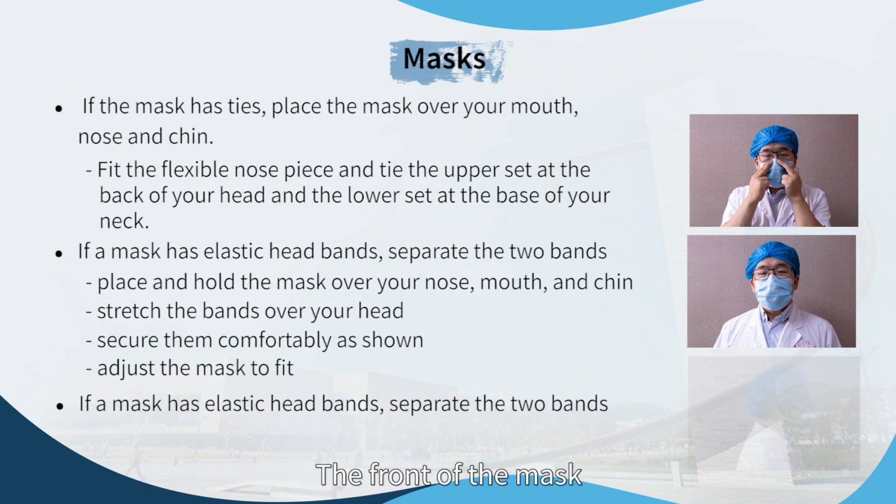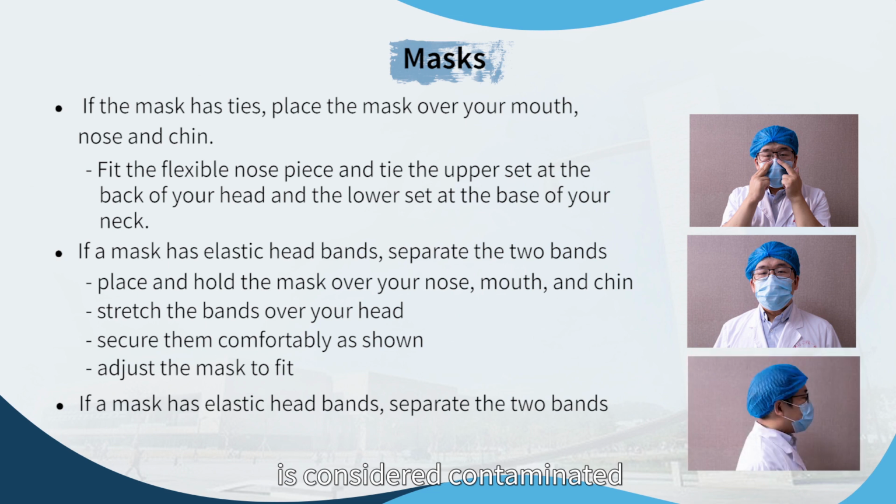The front of the mask is considered contaminated and should not be touched. Remove by handling only the ties or elastic bands, starting with the bottom, then the top tie or band. Lift the mask away from the face and discard it into the designated waste receptacle.